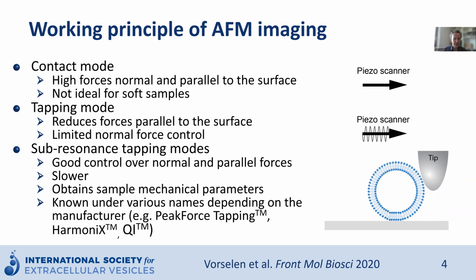So in addition, this mode actually also allows you to obtain sample mechanical parameters during imaging. And I will get back to that at a later point during this presentation. The main downside of this imaging mode is that it's considerably slower than tapping mode.